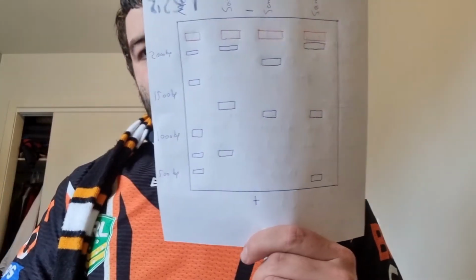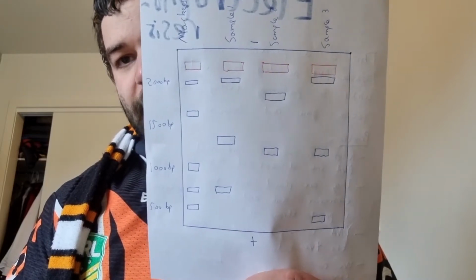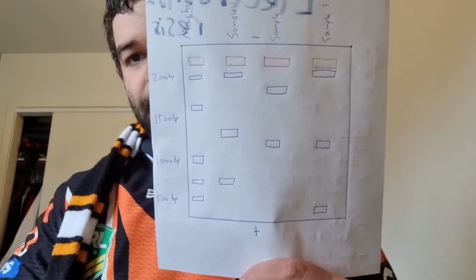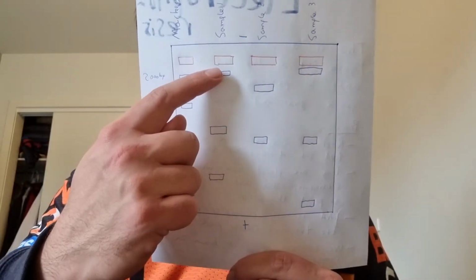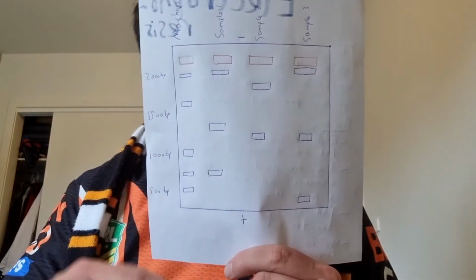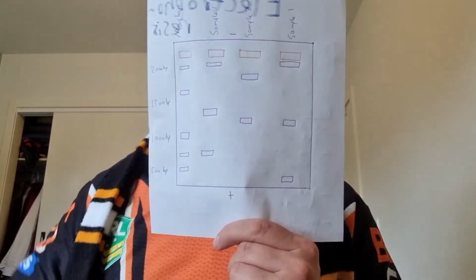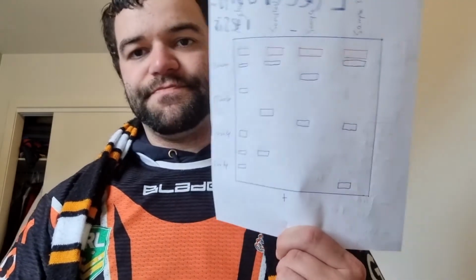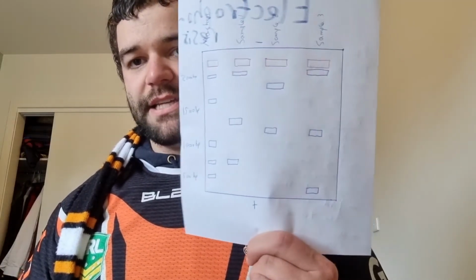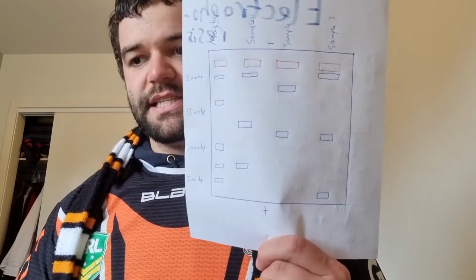And then we do the electrophoresis for whoever we're testing the DNA of, and then we could compare these to the markers to get an idea of how big their bits of DNA are. So this person's DNA, that fragment would be the same as the marker one, being about 2,000, for example. So this is the positive end, this is the negative end. The further down the fragments move, the smaller the pieces are. And people will get a pretty unique set of bands depending on their genetic makeup, because like I say, we've all got different numbers of restriction enzyme recognition sites due to our genetic diversity.